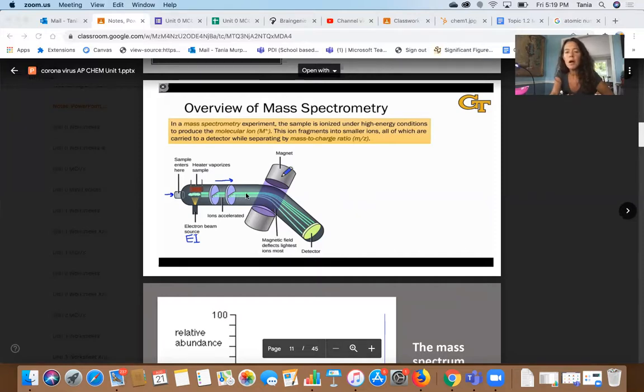Now remember, these are ionized into cations, right? Right here. That's how I knew this was negative, because it's attracted. If this is positive, I could easily infer that this must be negative. Okay, so that's it. You really don't need to know much more about that.